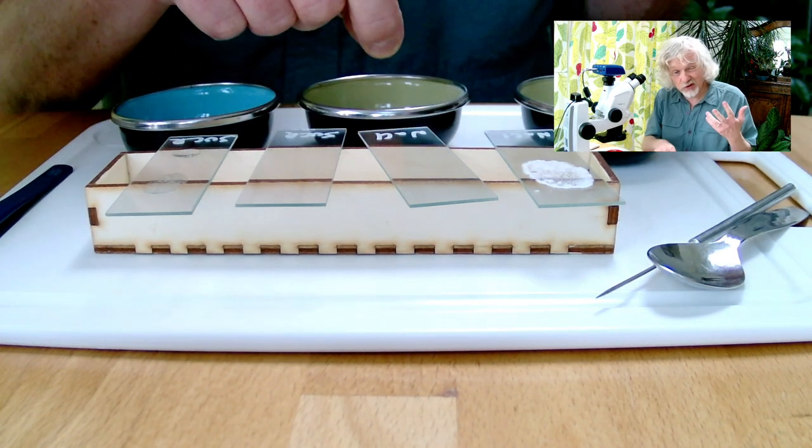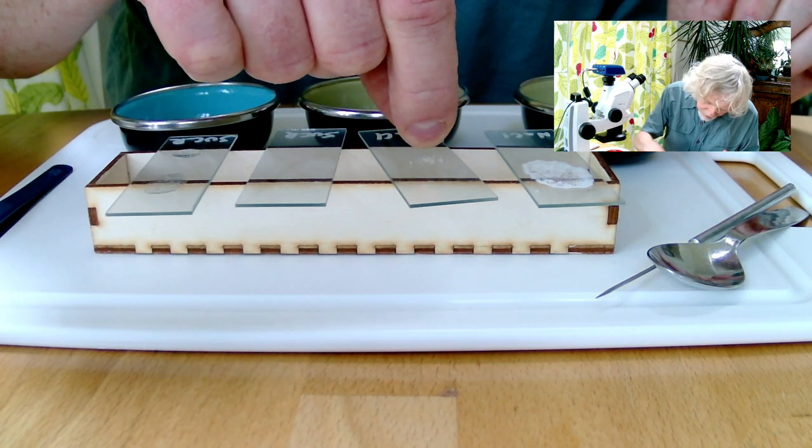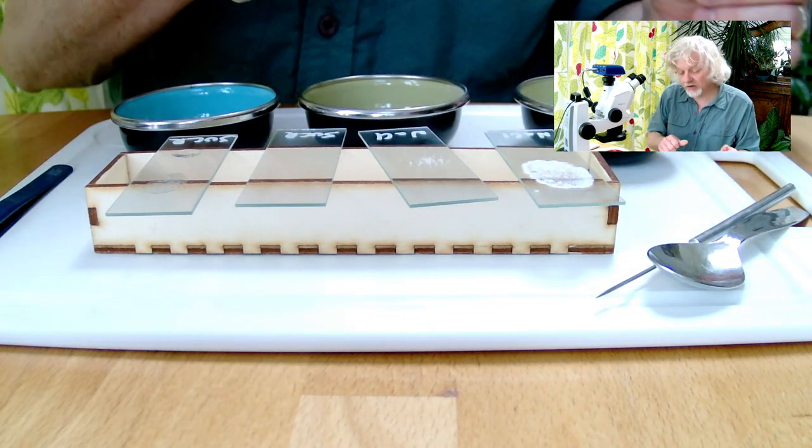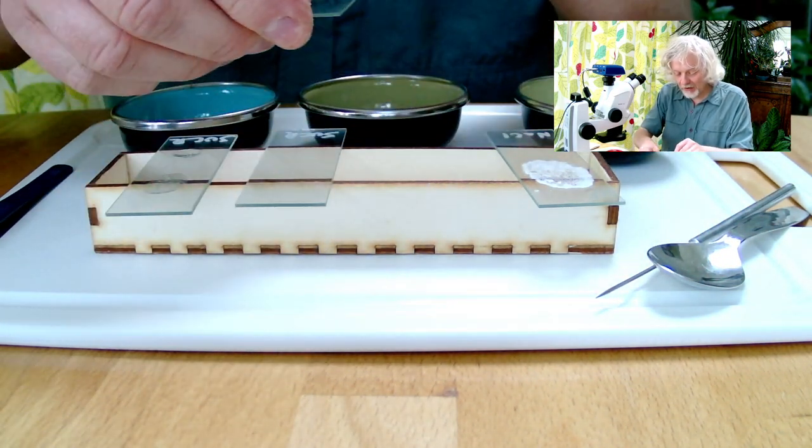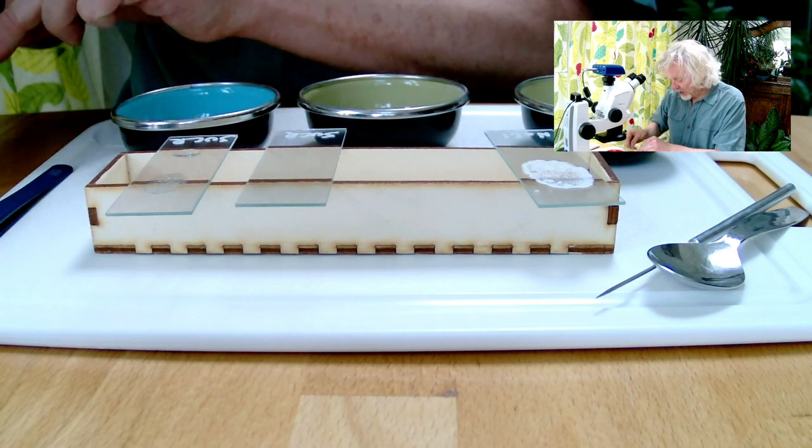I'm going to take just a few crystals and put that onto there like that. Just a few tiny crystals. This is just ordinary table salt, nothing fancy. And then that is going to go under my microscope, careful not to end up with it everywhere.